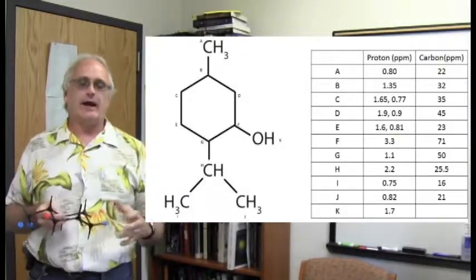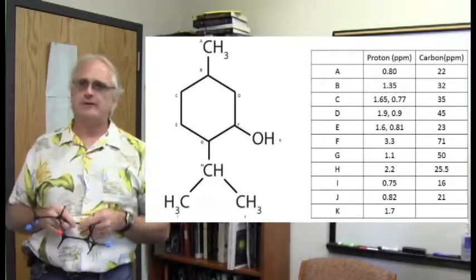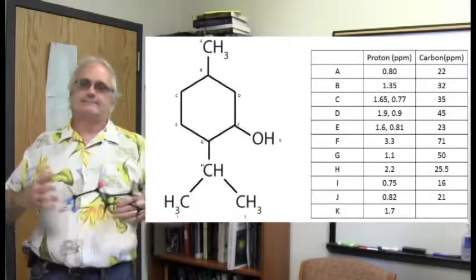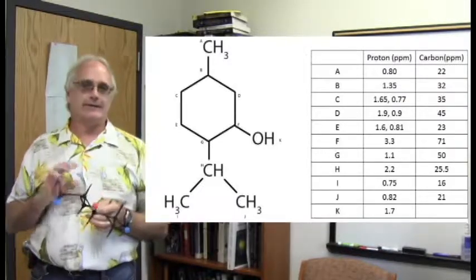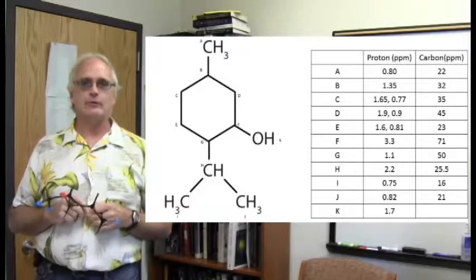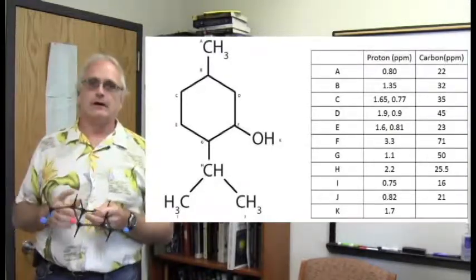Okay, they are so badly overlapped that probably not. I think they're reasonable estimates of their chemical shifts, but they just are so piled in there together that they are just simply estimates. But that's just kind of how it's going to go in a molecule that has this kind of overlap. If we had a larger magnet, that would give us more hertz between every single one of these signals to work with. It would help us to spread them out just a little bit more, allow us to be a little more definite, and tackle even larger molecules.